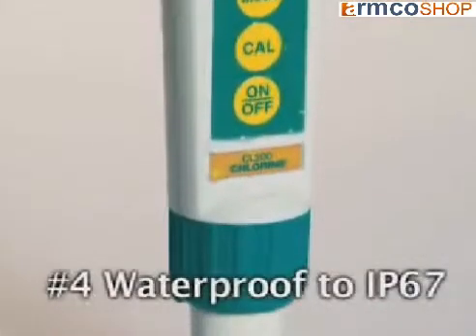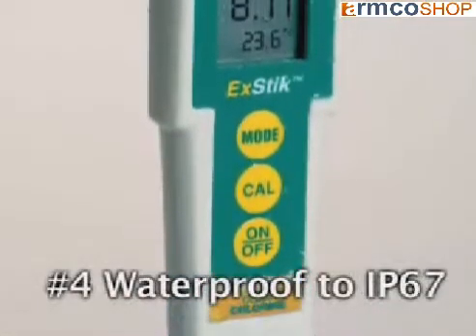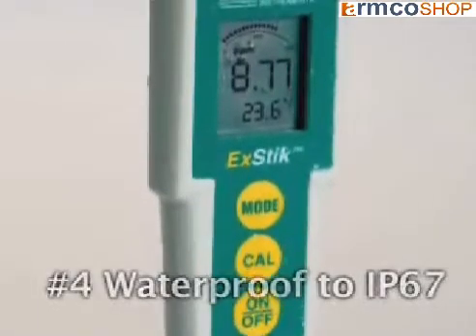Number 4. The EXTEC chlorine meter is waterproof, meeting the standards of IP67. This assures safe and accurate measurements even during extreme wet conditions. And it floats.